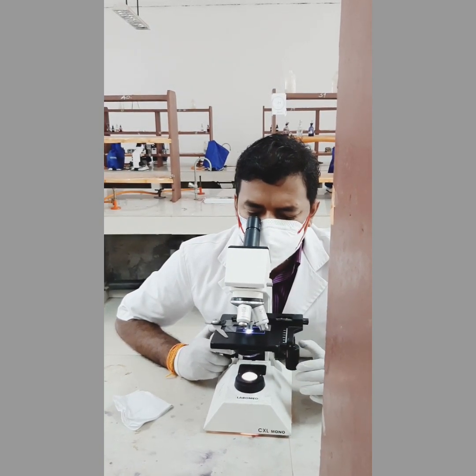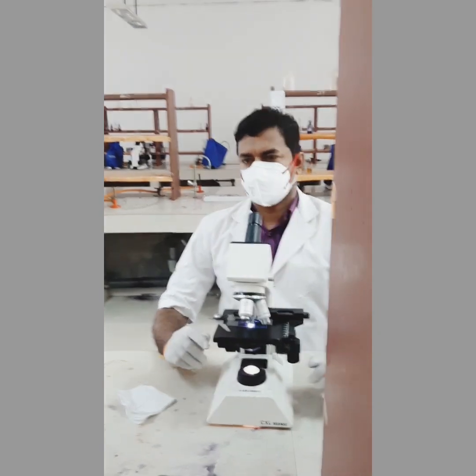The important questions you have to learn from this session: define acid fast is an important question. Then the modifications of Ziehl-Neelsen staining, which I think you have studied in your theory. Then another important one, I have already told you the percentage of H2SO4 for leprae, Nocardia, Cryptosporidium and spores.